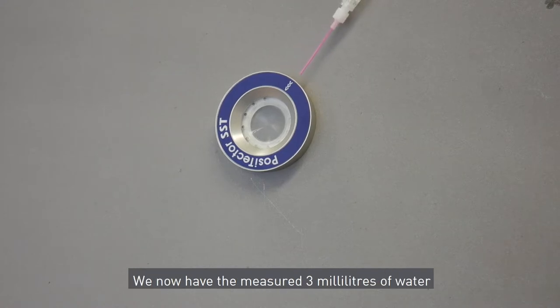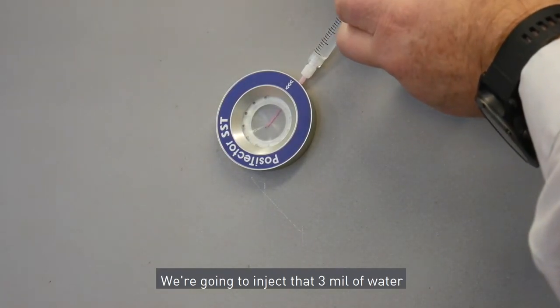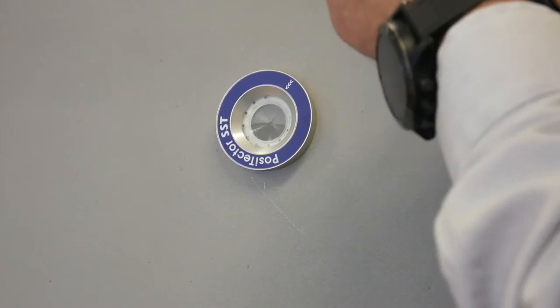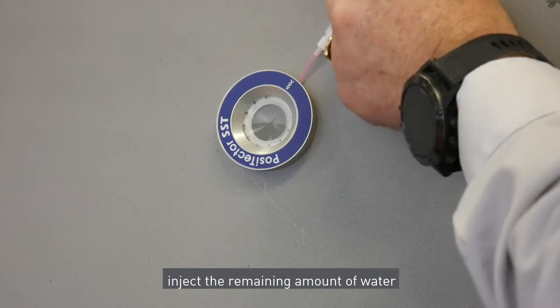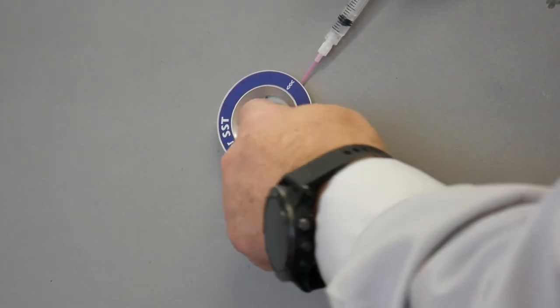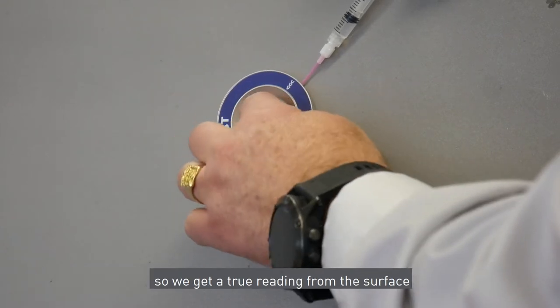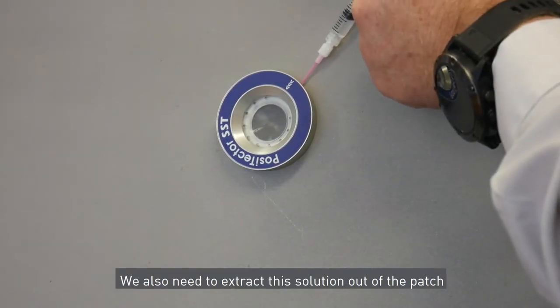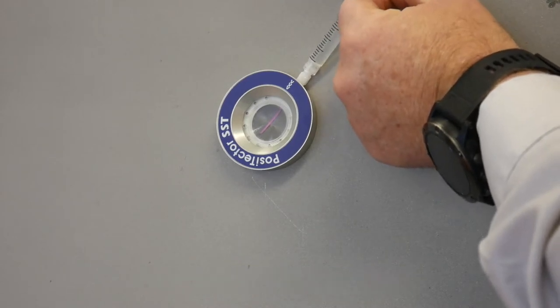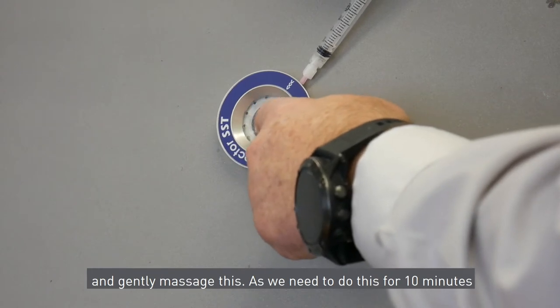Here we are — we now have the measured 3 millilitres of water that I'm going to inject into the Positector patch. We're going to inject that three millilitres of water now: the good thing is to inject half, remove any excess air, then inject the remaining amount of water to fill the patch totally — as you can see there's no air. We have to gently massage this patch for approximately 10 minutes to make sure that we get all of the contaminants and a true reading from the surface. We also need to extract this solution out of the patch a minimum of four times as per the standard — we'll see you all in 10 minutes.